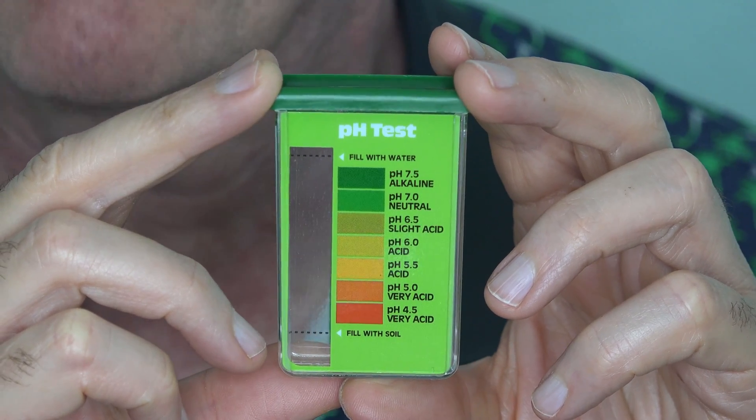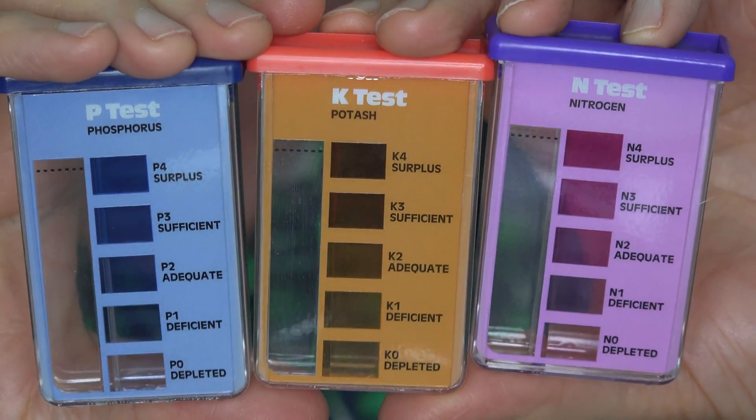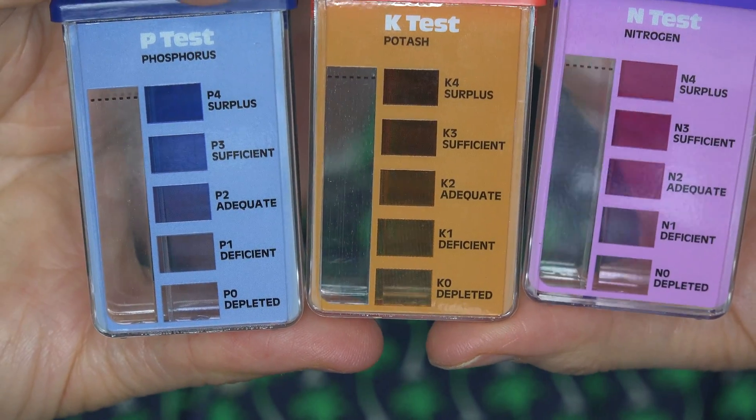The way these test kits work, the pH test is a little different from the others. I'm going to get a little bit of soil and put it in the bottom of the container, add distilled water to the rest, and then take a capsule — you can see I have different colored capsules here — the one that matches the color of the container. One capsule, open it over the top, shake it up real well, wait the specified amount of time, and then compare the color that shows up in my mixture compared to these pH levels. This isn't a pH meter, so it's not going to give me an exact number, more a close approximation based on the color that matches.